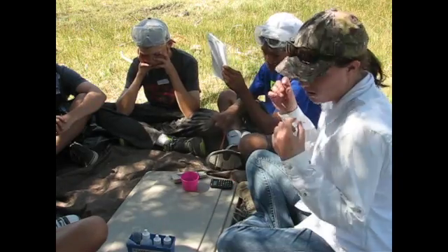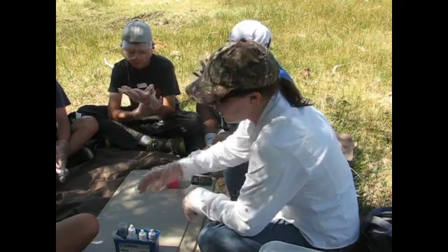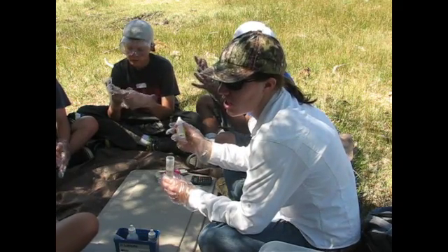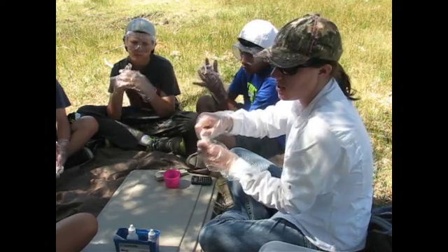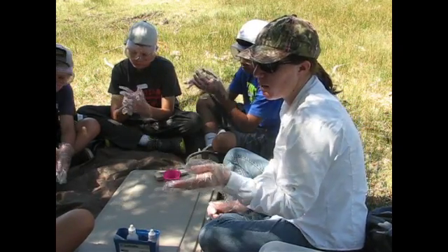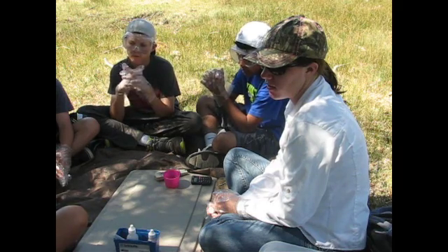So if you guys will put your goggles on. We're going to be looking for a color change. First we're going to add pink color to the water. Christian, would you like to add 10 drops of this to it? I want you to hold it completely up and down. And if you guys want to help count the number of drops, that'd be helpful. 2, 3, 4, 5, 6, 7, 8, 9, 10.